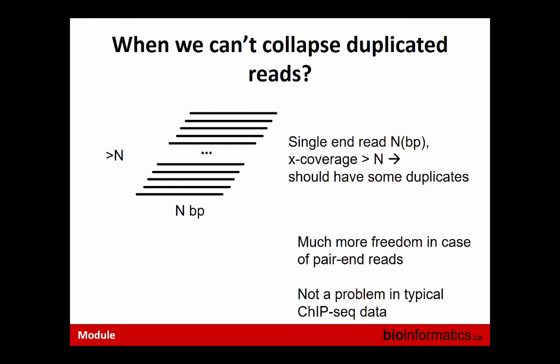If you are working with typical ChIP-Seq experiment, the true coverage, from the data we normally work at the moment, shouldn't be higher than 100, 200. If it's single end read, maybe yes, then you would like to choose your duplicated reads. But also try to do this with some care, because of course when you accept duplicated reads, then you will have some locations which are spurious locations you are getting just because you stuck on each other those duplicated reads.